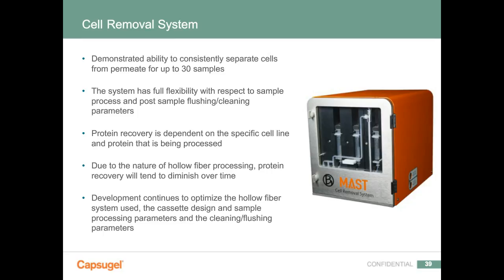After the system is set up, there is full flexibility with respect to sample processing, and after every sample is processed, we run a flushing and cleaning process.